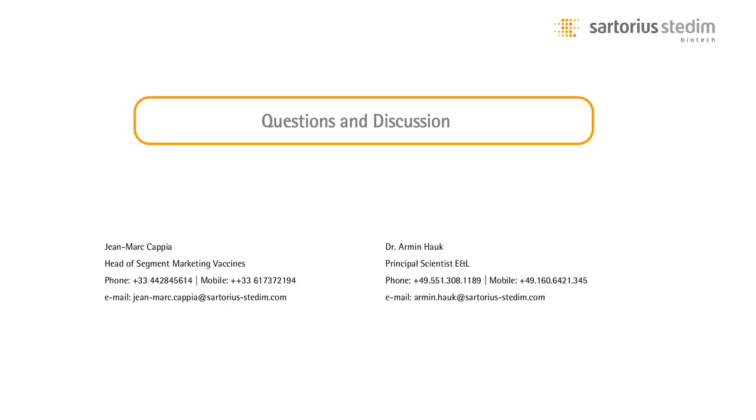And I saw there is a question how we define short and long-term exposure. For the devices which are used for long-term storage, we have kinetic data, so I know exactly when they are running into equilibrium, and I can say for typical bag materials, you can assume short contact times means time between some hours and days, and long contact times for bag materials and tubings, for example, means 30 days, 70 days, then you are starting to run into equilibrium. And this is reflected, of course, in our matrix for testing.